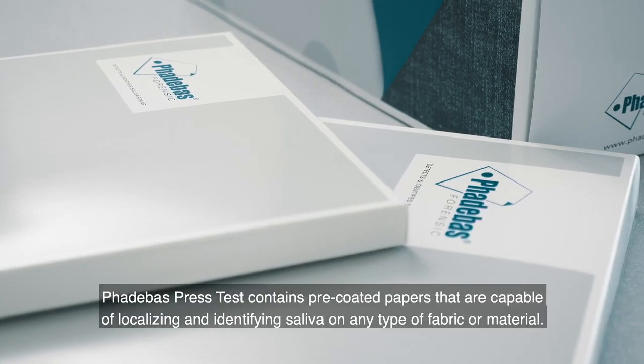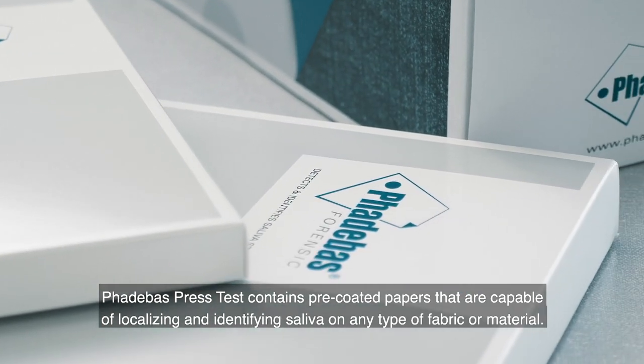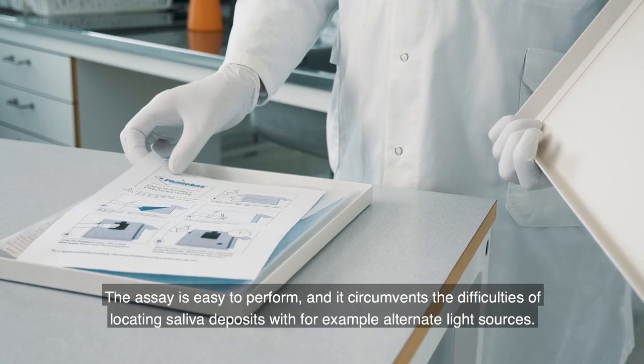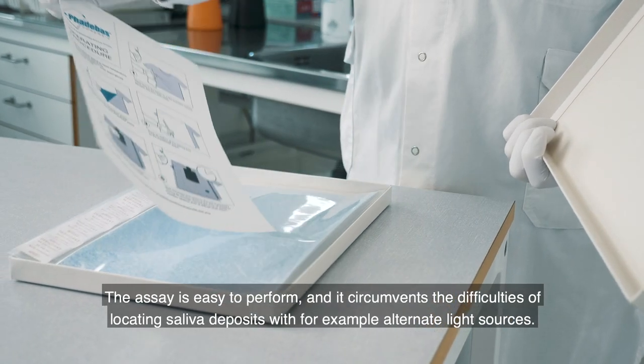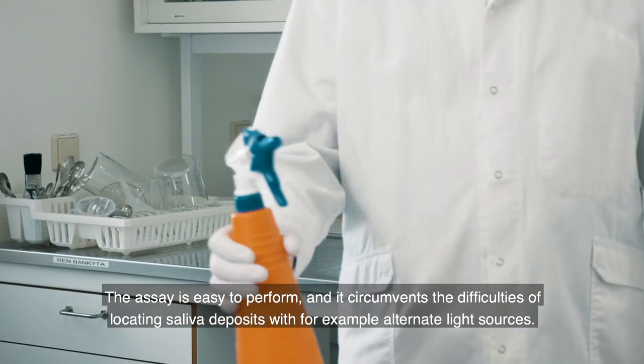Phadebas Press Test contains pre-coated papers that are capable of localizing and identifying saliva on any type of fabric or material. The assay is easy to perform and it circumvents the difficulties of locating saliva deposits with, for example, alternate light sources.